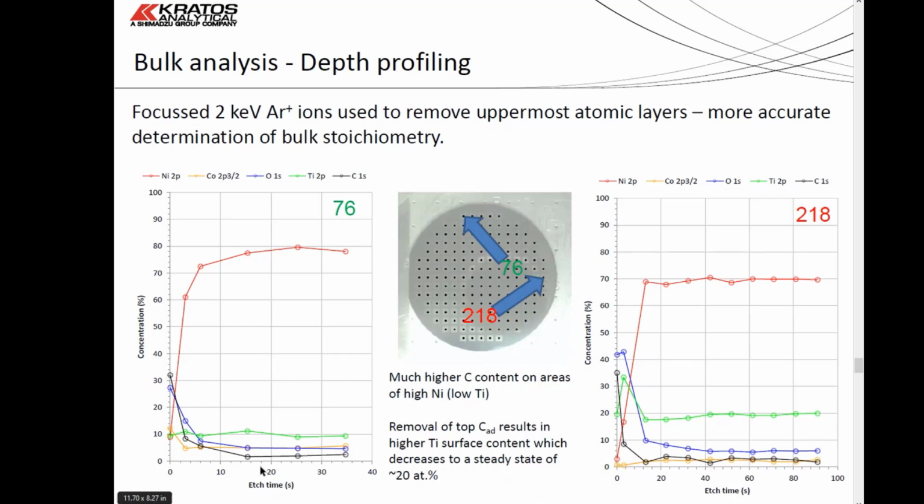So here we did depth profiling. The main interest was because these guys were like, okay, we're doing materials analysis, but you're obsessed with the surface. I want to see what's going on in the bulk. Is the bulk representative of what you're seeing on the surface? Because I was always saying there's loads of carbon there, and they're like, there's no carbon in my material. But that's the kind of conversation between people from different groups, I guess.